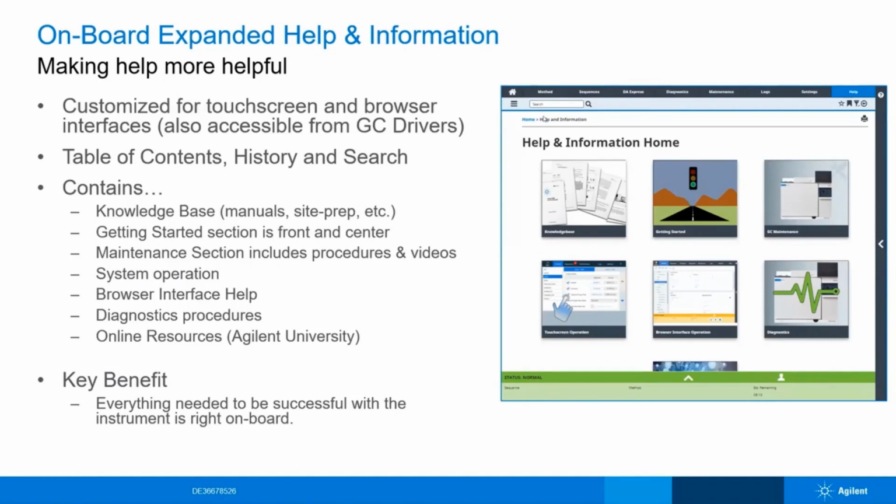You can see here that the table of contents will take you to the various different manuals, operation manuals, user manuals, and many different types of information, logs, etc. These are really, really useful to identify potential problems, ensure that you're following best practices, and learn more information about your particular system without, for instance, asking, like we say, Dr. Google.